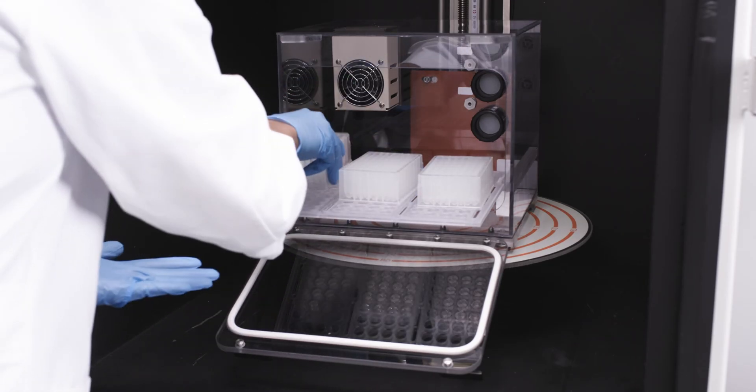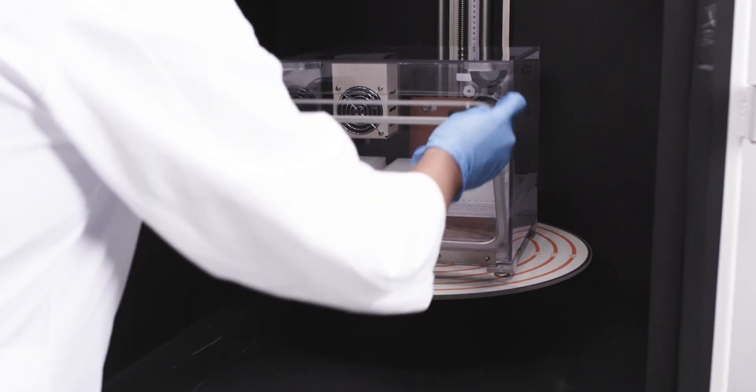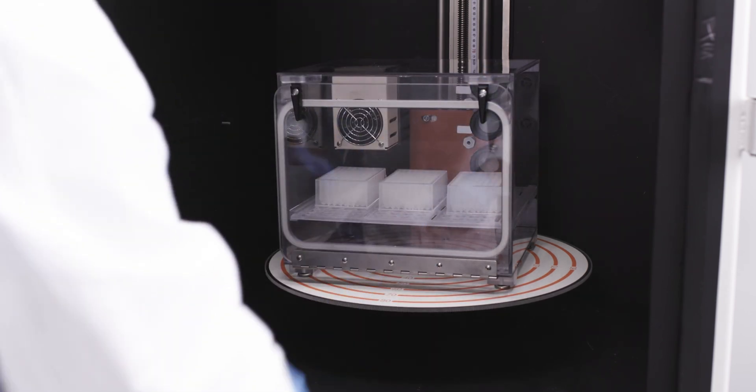When looking to test the optimal response of a sample, adding an environmental chamber to the X-RAD system allows users to control humidity, temperature, or hypoxic conditions as variables.